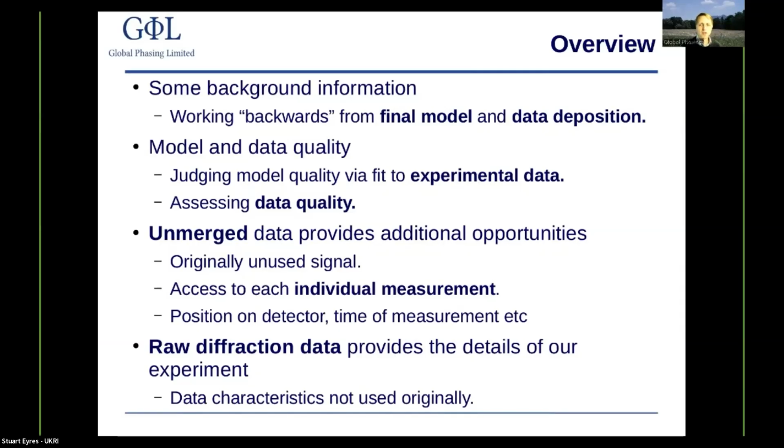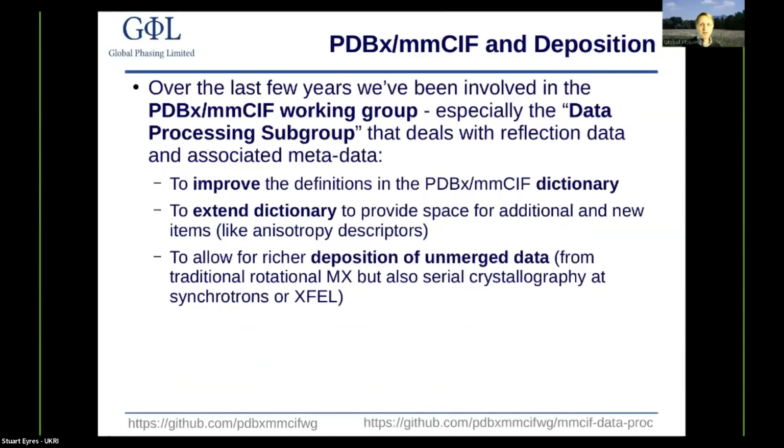We will look at unmerged data in much more detail to show the real added value this can provide to everyone when made available for each deposited model. Obviously, unmerged data is only ever a summary of the raw diffraction data itself, so we'll venture a bit into this area as well.